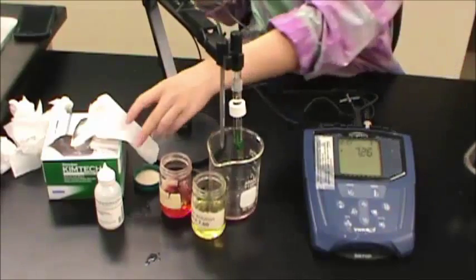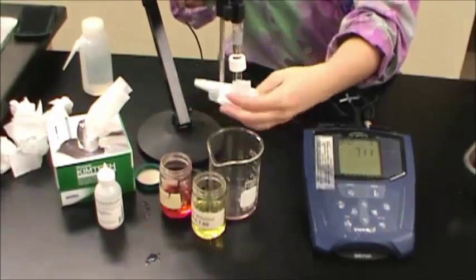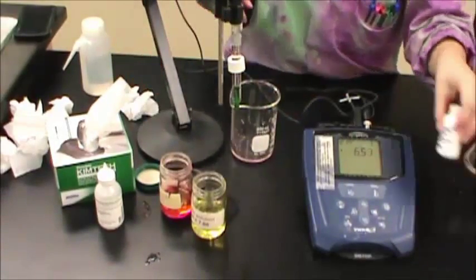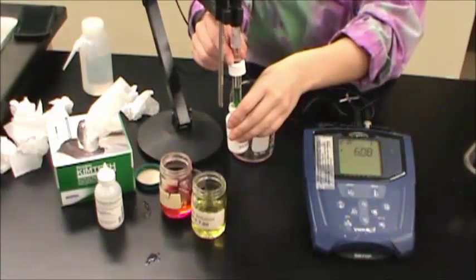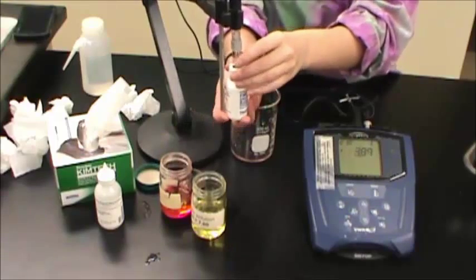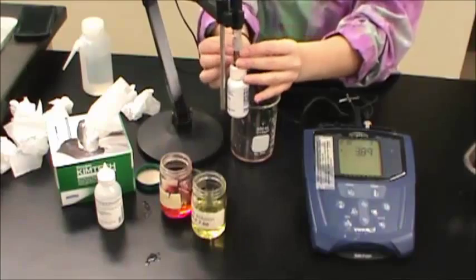When you are finished running all of your samples, rinse the probes a final time and blot them dry. Replace the bottle of electrode storage solution on the end of the pH probe and move the clear band around the probe so that the vent hole is covered. Turn the instrument off and return it.